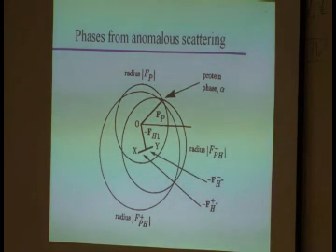How does anomalous scattering work? Well, it's the same as growing the heavy atom derivatives. The main difference is you have your minus F(H1) and then you have the F double prime contribution in both directions, positive and negative. And then you have to draw the two circles around these points. But once again, you get 3 circles and you get 1 intersection point. So that's how you get your phases there. That is why a lot of people go to the synchrotron, because at the synchrotron, you choose your wavelength. In the lab, not quite so easy.